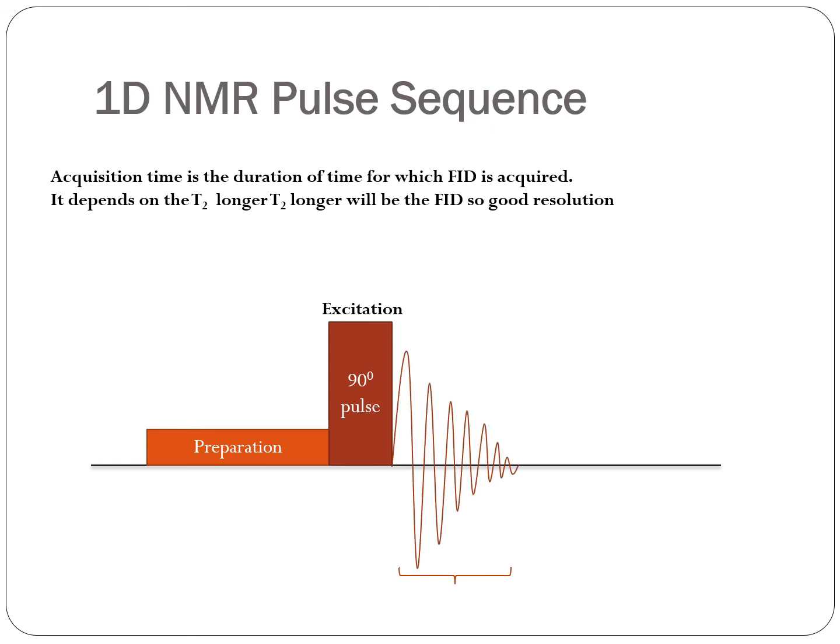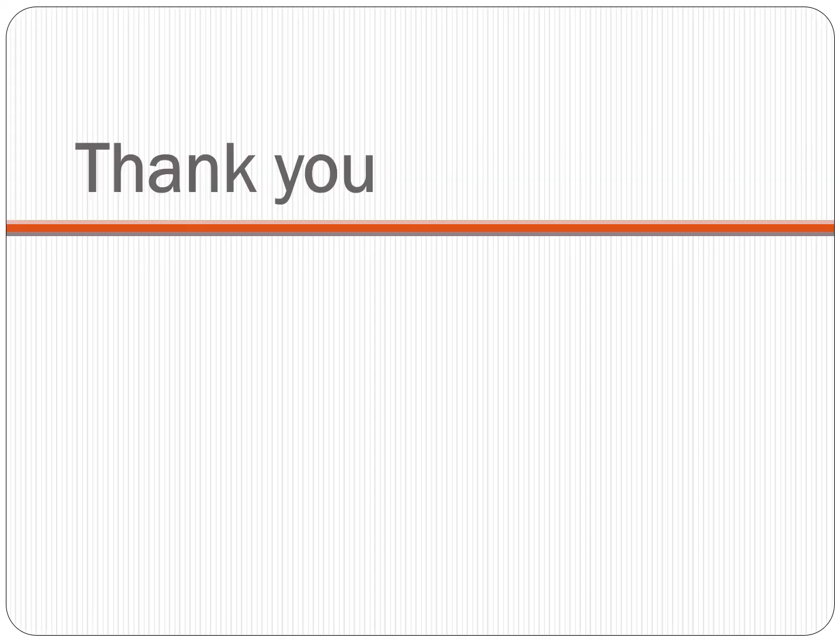Now what happens? We get a FID, also called as acquisition. So this is the acquisition time. You can see this is the FID, and this place of the FID is called as acquisition time. Now this is detected, this is recorded in the recorder, and this is the detection of the signal. So like this we can detect our FT-NMR.